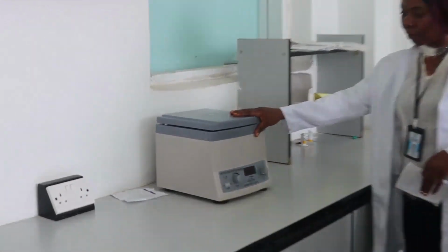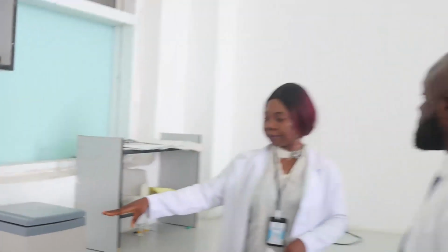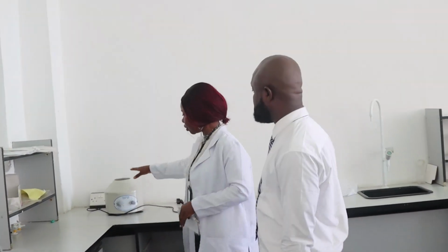This type is used for PCV, that's packed cell volume of the patient. So we use this type for that. This is a hematocrit centrifuge. We have another centrifuge. This one is basically two centrifuges. We can use this for sedimentation of maybe urine or other specimens.